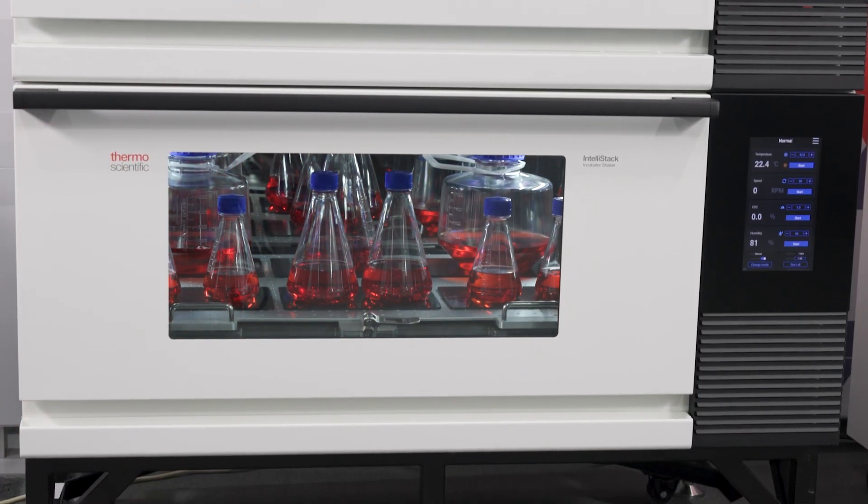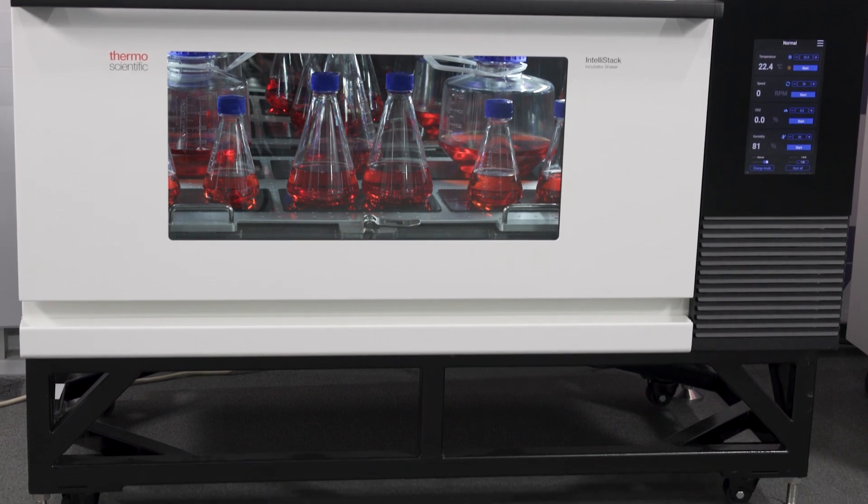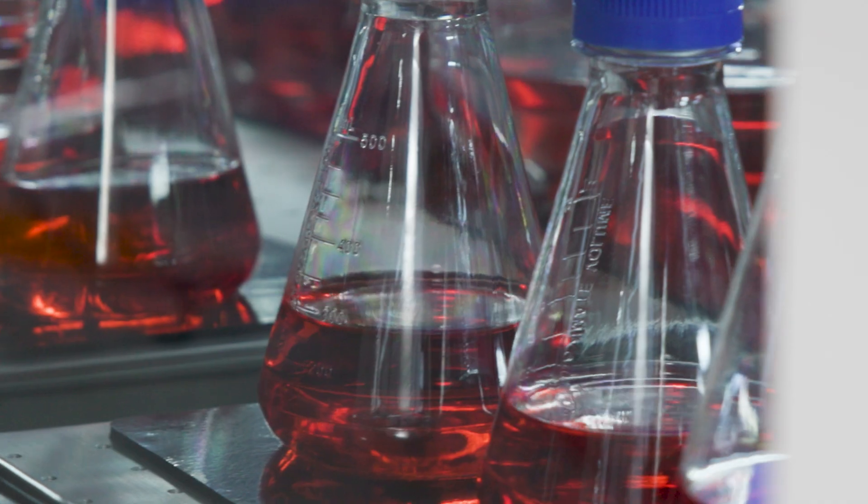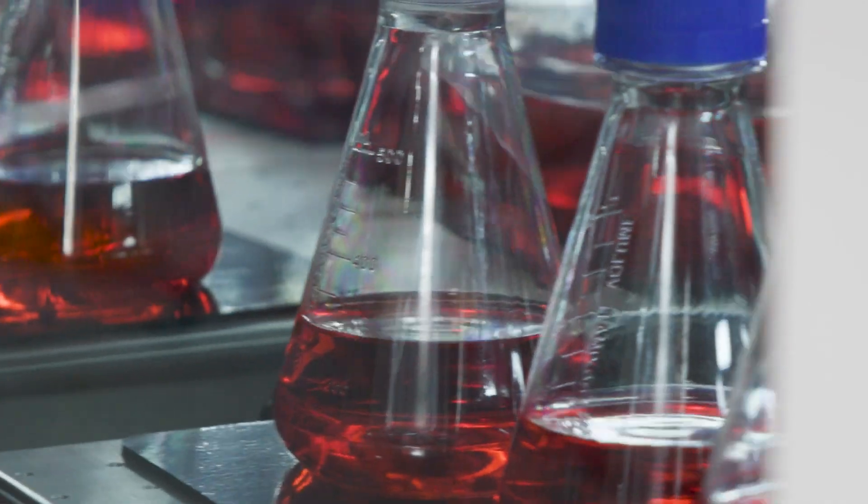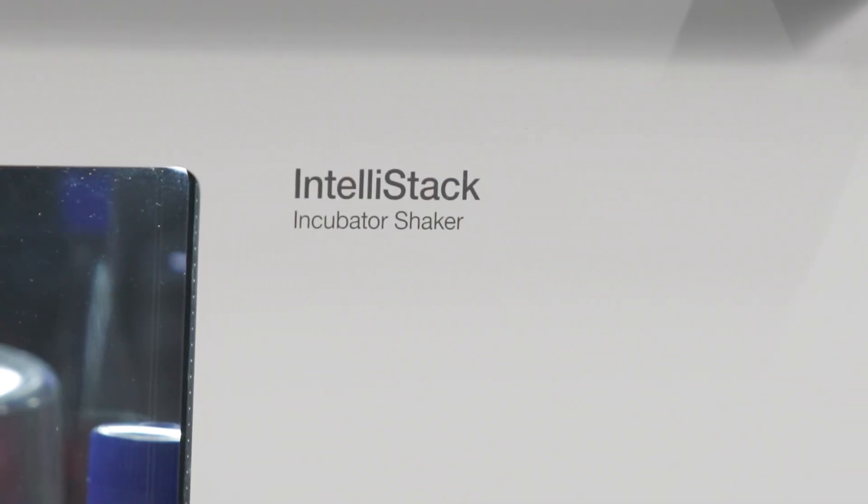Hello and welcome to this video about operating the touch program interface of your ThermoScientific IntelliStack Incubator Shaker or IntelliStack CO2 Incubator Shaker.